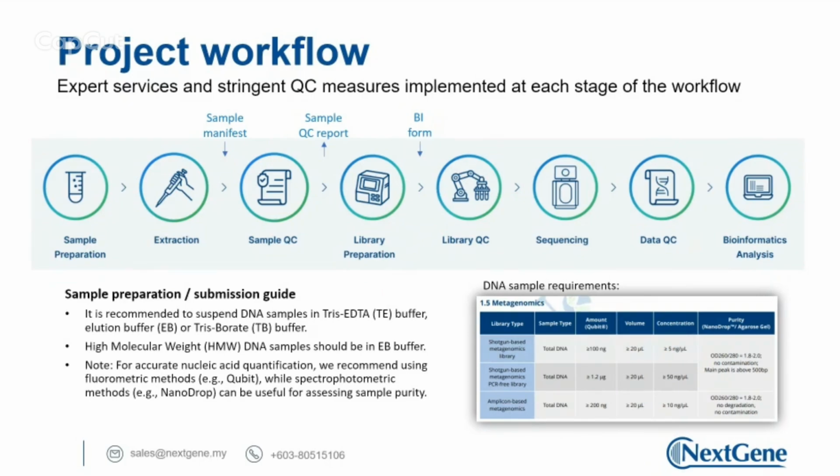And then the sequencing lab will not immediately start on the sequencing part. They will do some QC check on the samples, and then tell you whether the samples passed the QC, or maybe some of the samples are at risk, and then see whether you want to resend the samples or continue at risk. All this will be in maybe the first 1 to 2 weeks.